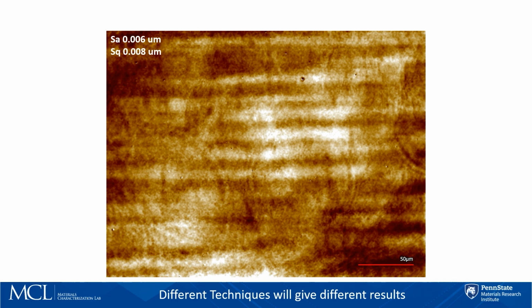So this is an example of a surface that has been measured. This is a very smooth surface. Now, this surface actually has small nanoparticles all over it. Now, for the Keyence system, because we are raster scanning, we end up with a lot of interference lines superimposed on here. And so the roughness here, even though it's saying 8 nanometers, it's not really 8 nanometer RMS roughness, because the majority of this is actually the interference fringes that we're getting from this.